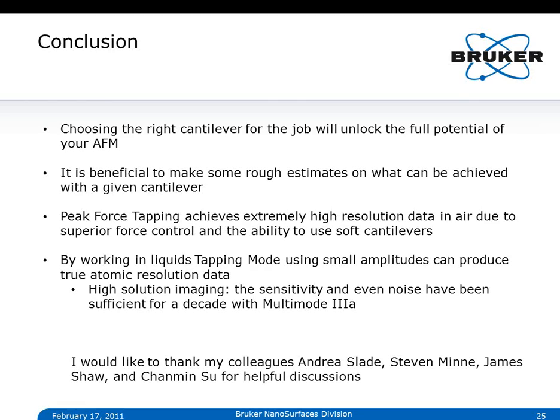He's the one that signs off the budget, so maybe I shouldn't say that. But there are ways to clean probes, and in fluids people do that. And the data I showed you from the group in 20, they definitely cleaned the probe with alcohol, I think it was alcohol, if I remember correctly, before they used it. There are a variety of cleaning methods, and I think we have an application note on it. If I'm not completely mistaken, it might be in one of the bio application notes. If you contact me offline, I can look it up for you.